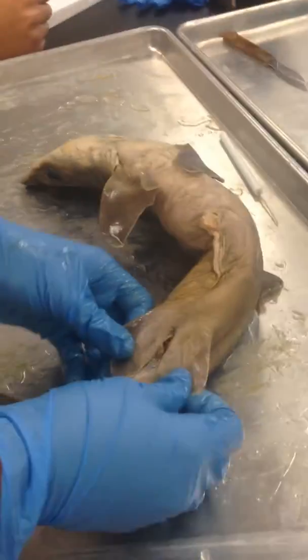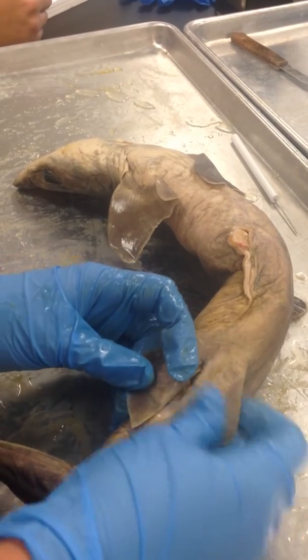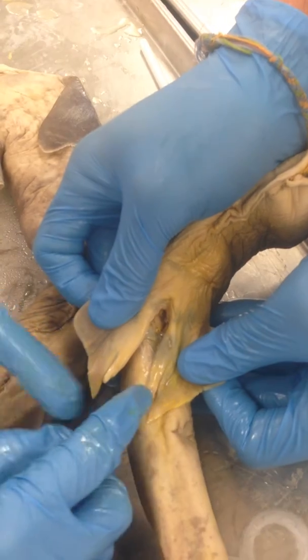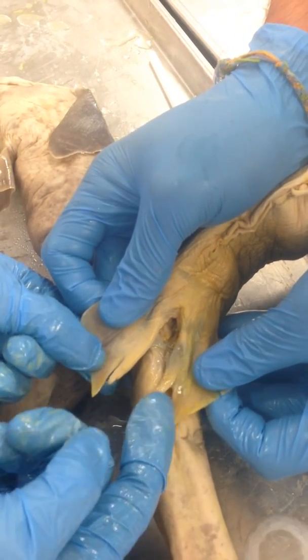If you flip the dogfish shark over, you can see the cloaca right here. And then if you go over to the male, you can see the claspers, and that is only seen in the male, not the female.